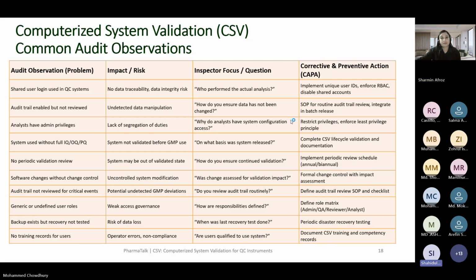So it is required that a qualified person who understands the product or the procedure, like the in-charge of the lab, should create this recipe.